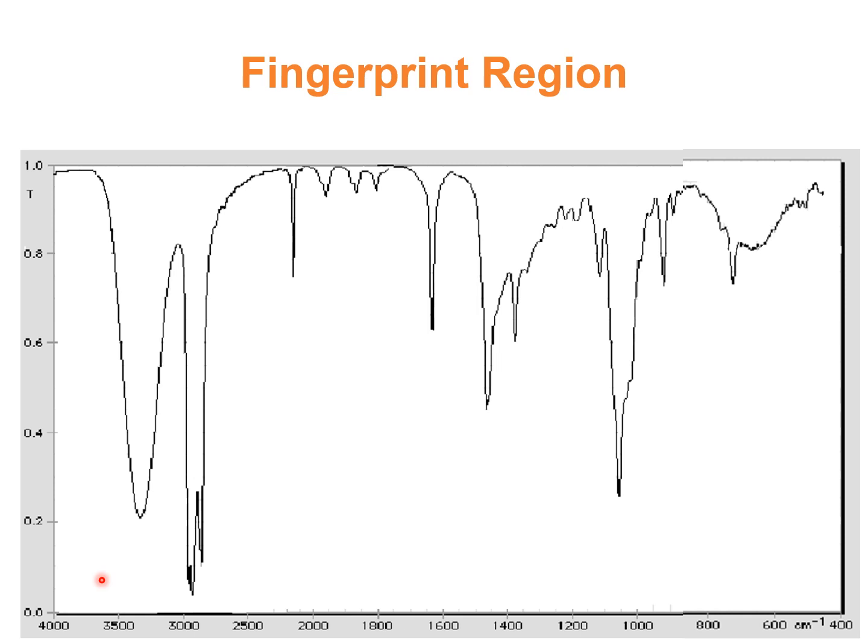Pharmaceutical drugs, those organic compounds, they mostly show peaks between this 400 to 4000 centimeter inverse, which is the mid IR region. And this transmittance scale may be given in the percentage starting from 100 at the top or 1 at the top coming to 0 at the bottom. Now this spectra from 400 to 4000 is divided into two main regions, and that boundary line is at 1400. So 400, 1400, 4000.